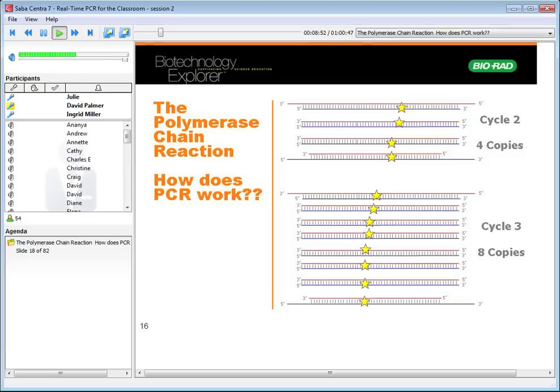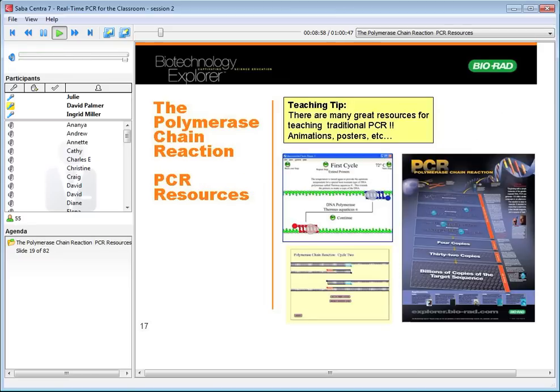So PCR goes on in an exponential manner, and I know many of you have taught PCR already and are familiar with that. When I teach PCR at the local community college, Contra Costa Community College, I often use a nice little animation that Bio-Rad has. It's got a lot of detail on it. It's very well drawn and very clear, and also scientifically accurate, which is kind of nice. So it's my favorite animation.